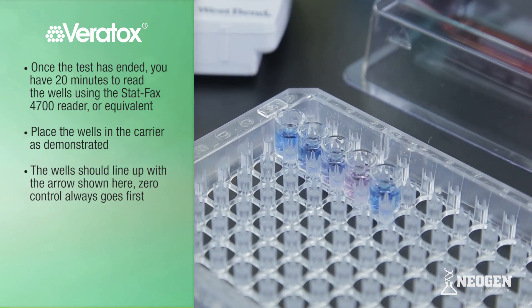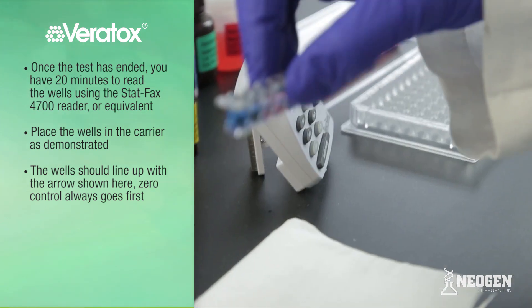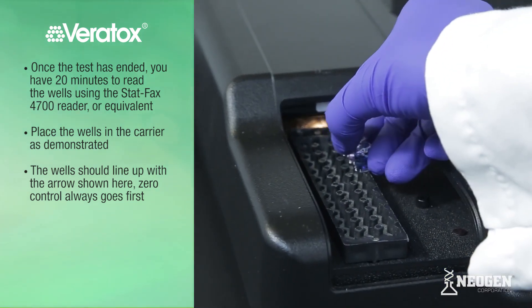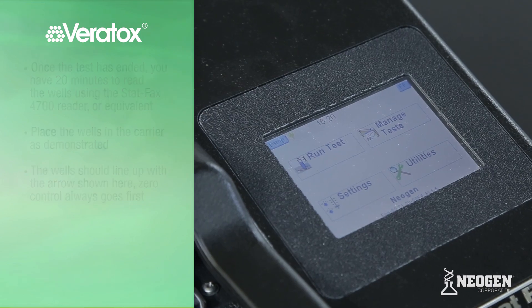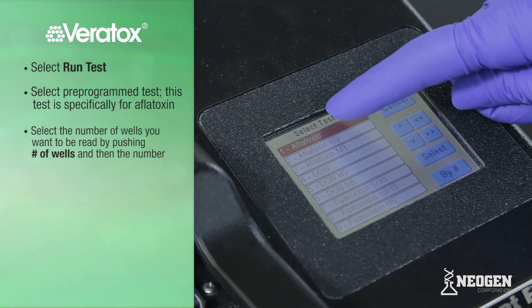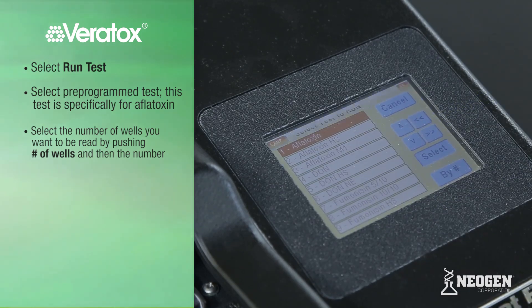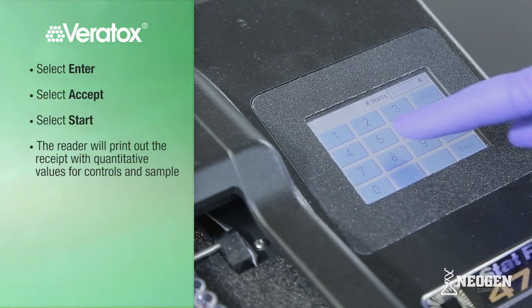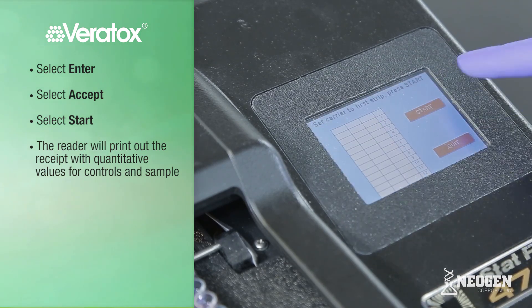Once the test has ended, you have 20 minutes to read the wells using the StatFax 4700 reader or equivalent microwell reader with a 650 nanometer filter. Wipe the bottom of the microwells, ensure there are no air bubbles, and place the wells in the carrier with the zero control always first. Select Run Test, then select the appropriate test programmed into the reader — for this demonstration, we are performing test number one, AFLATOXIN. Select the number of wells to be read by pushing the number of wells, entering the number, and selecting Enter, then Accept, then Start.